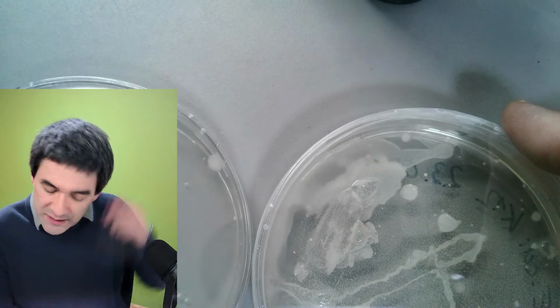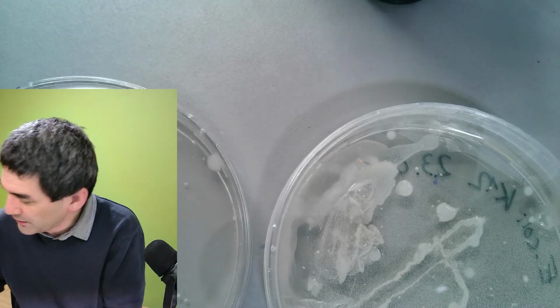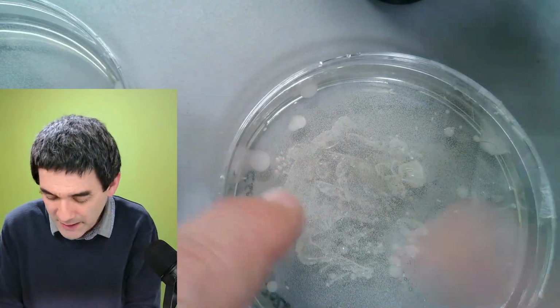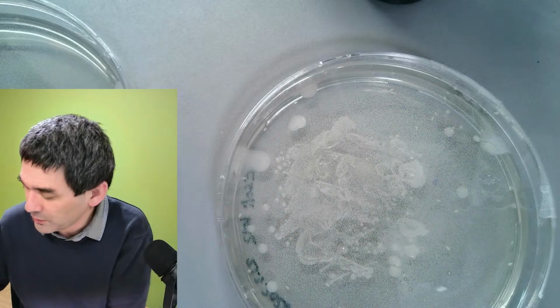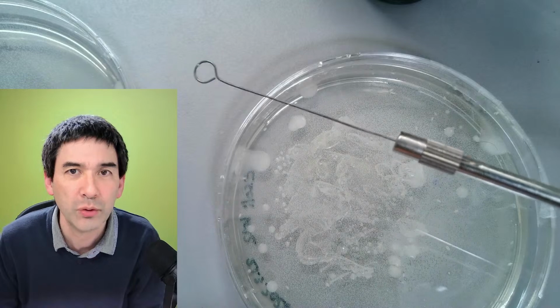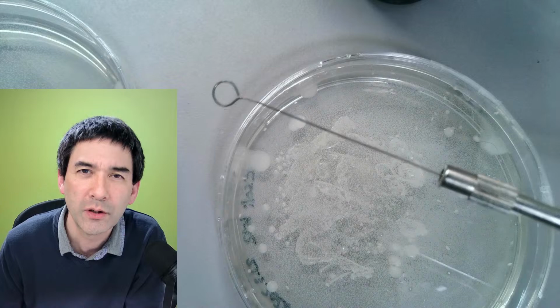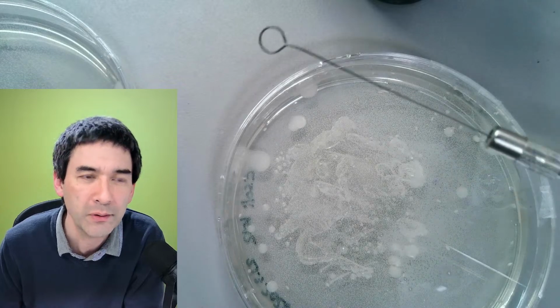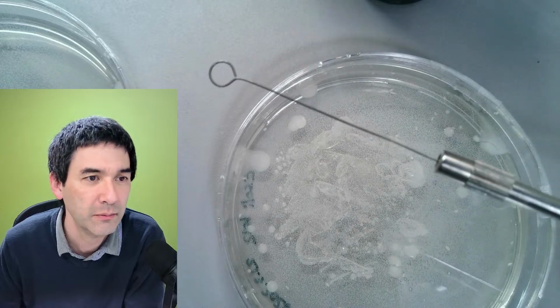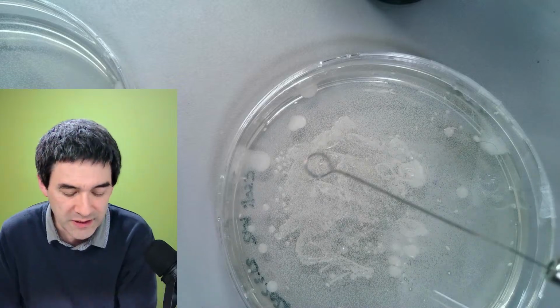And what I'm going to do is take this one here, because these are E. coli bacteria. Again, very bad because I did not spread them properly. I have over here the favorite tool of a microbiologist. How do you call this? An inoculation loop. For those of you who speak German, an Impföse. It's an inoculation loop which allows me to pick up colonies here.